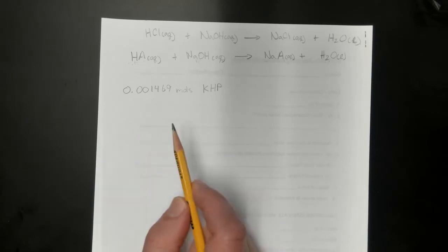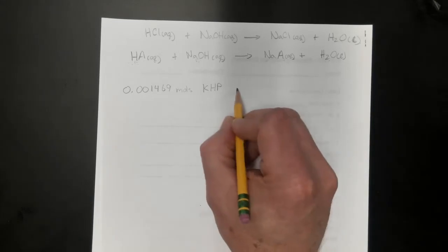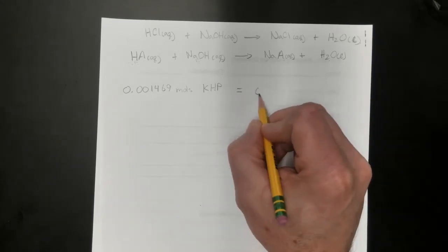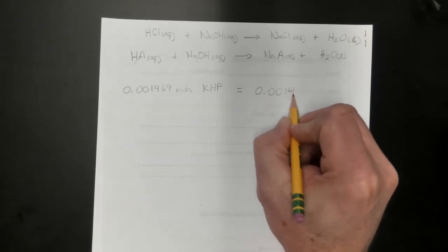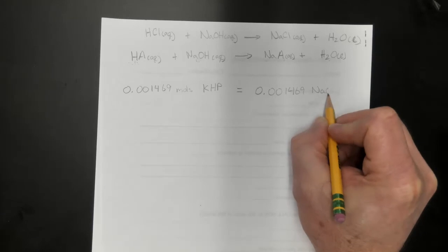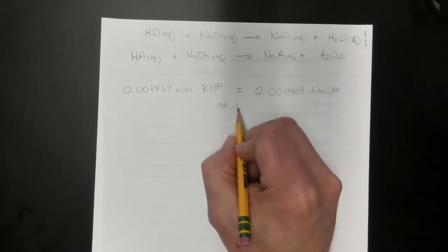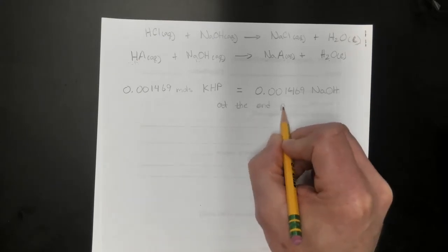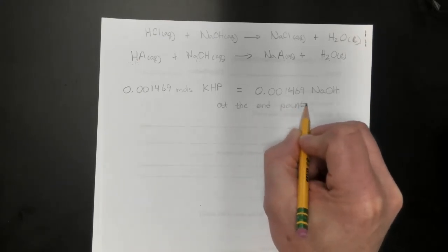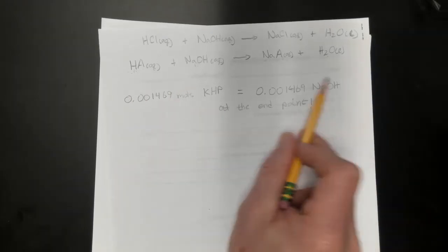So at the end point, again, this also has to equal the number of moles of sodium hydroxide. Again, this is at the end point, when our solution turns pink. At the end point is when this is true.